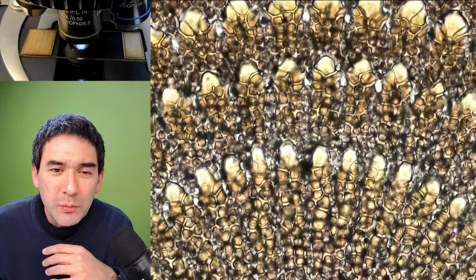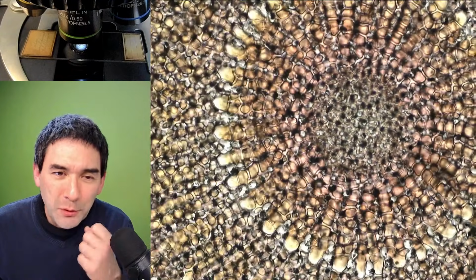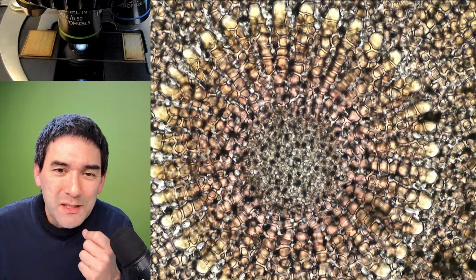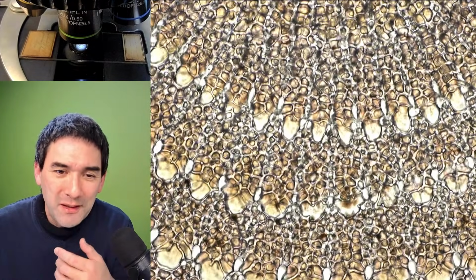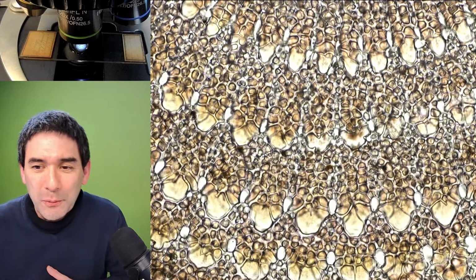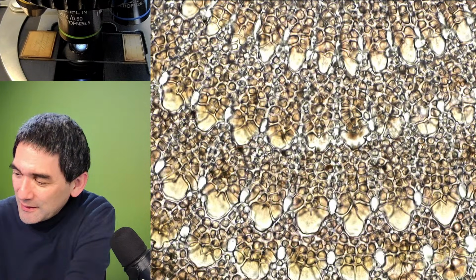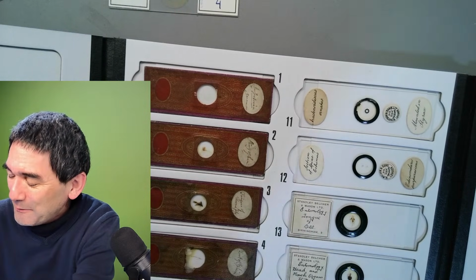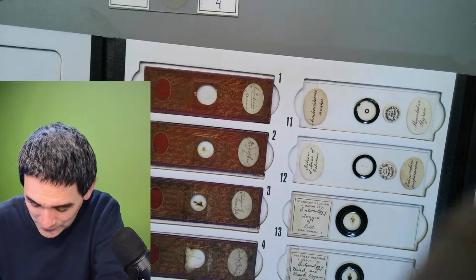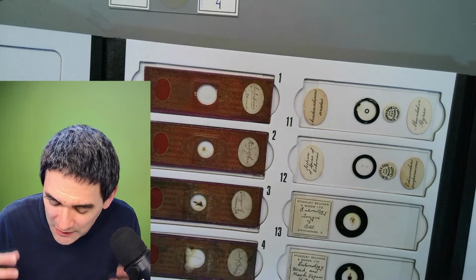Well, of course, it's got to be in the DNA of the organism, in the genetic material. But the problem is you're not able to pinpoint any specific location. Sometimes patterns appear during development. That's the interesting part. It's called an emergent property. This is something that also fascinates me: not all of the beauty and the patterns are directly encoded in DNA, but sometimes patterns emerge during the development.